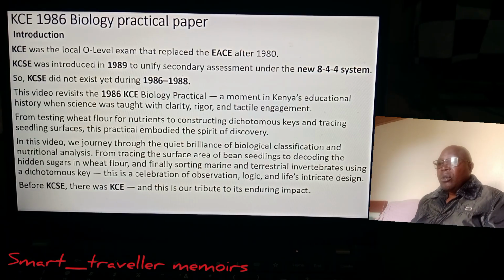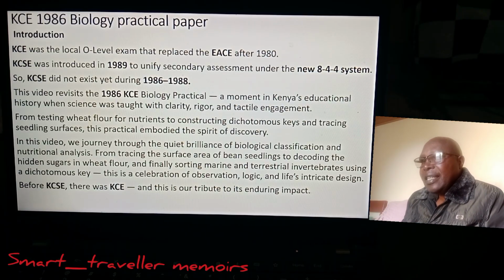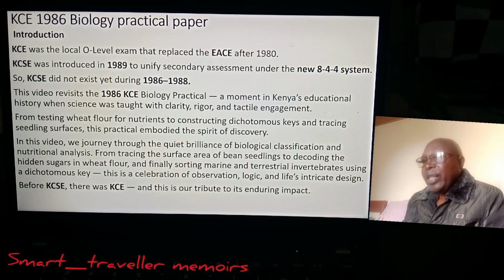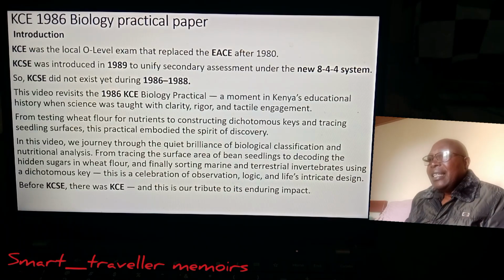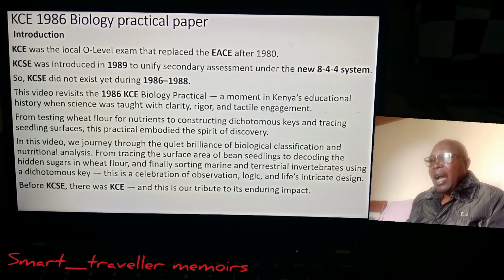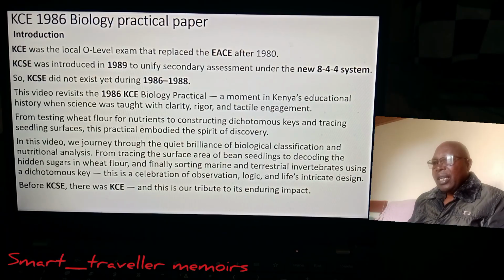So this video revisits the 1986 biology practical, a moment in Kenya's education history when science was taught with clarity, rigor, and tactile engagement. From testing wheat flour for nutrients to constructing dichotomous keys and tracing seedling surfaces, this practical embodied the spirit of discovery.